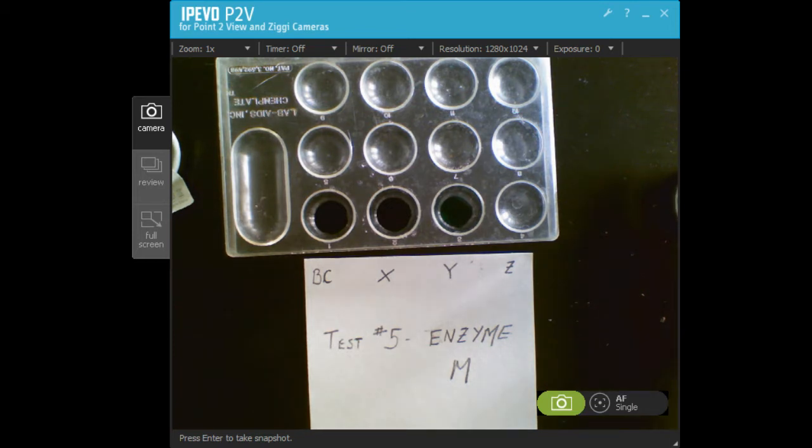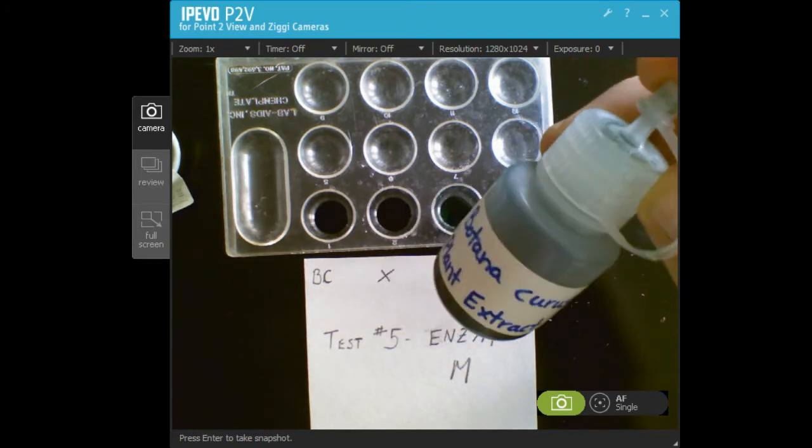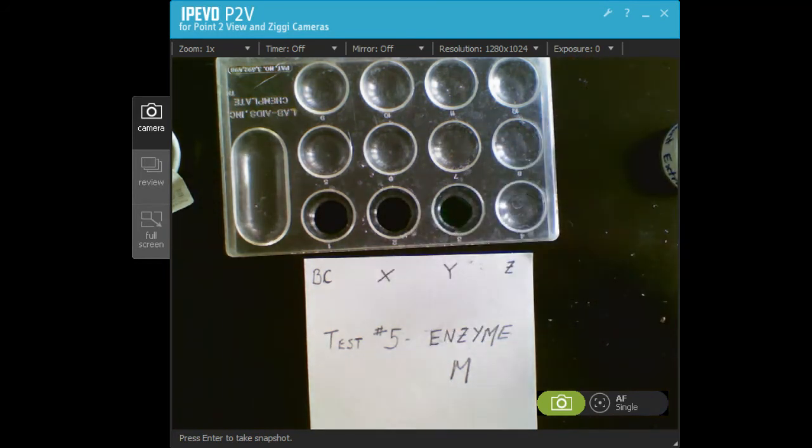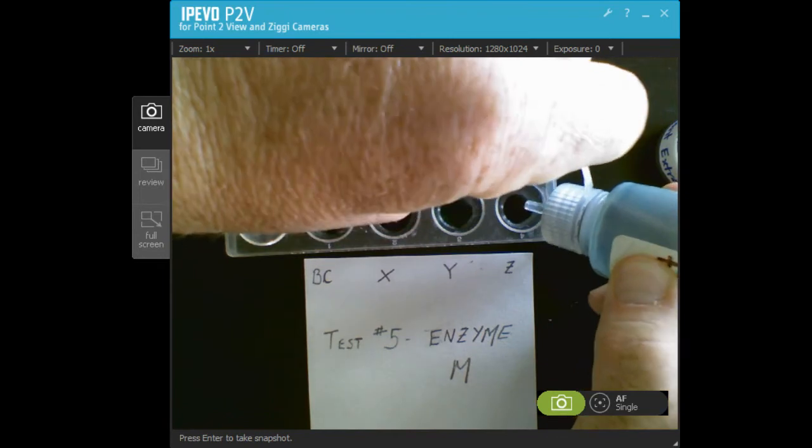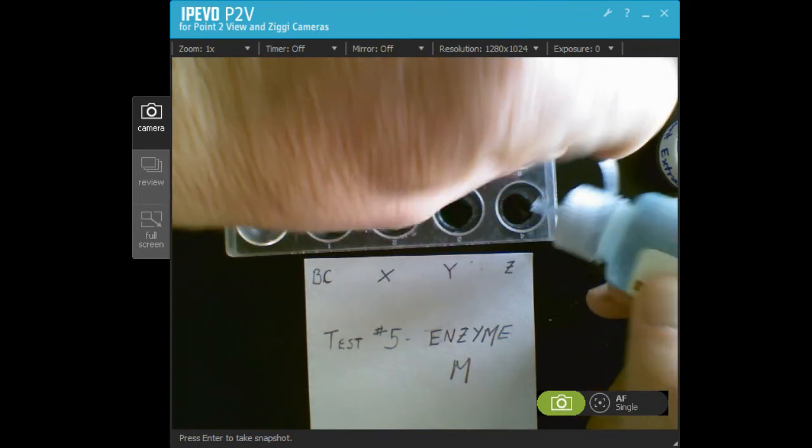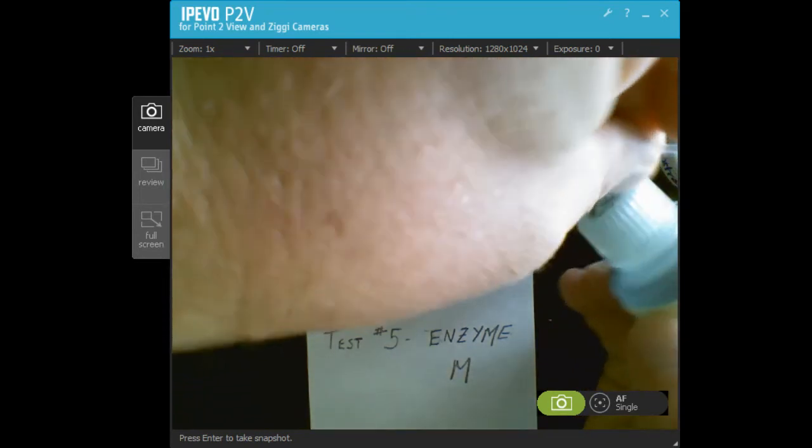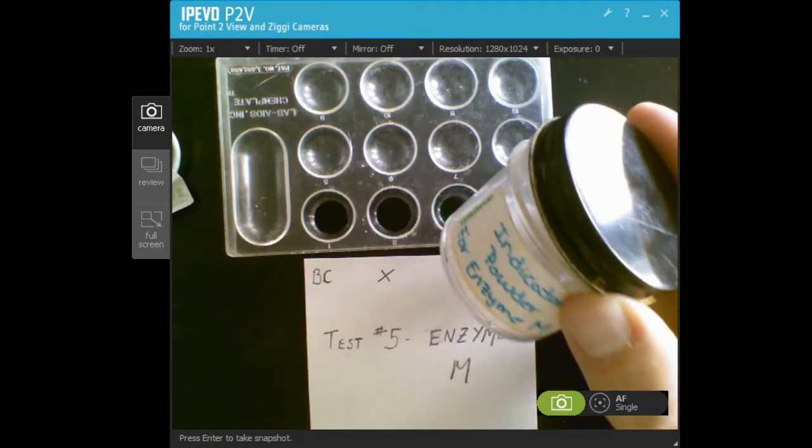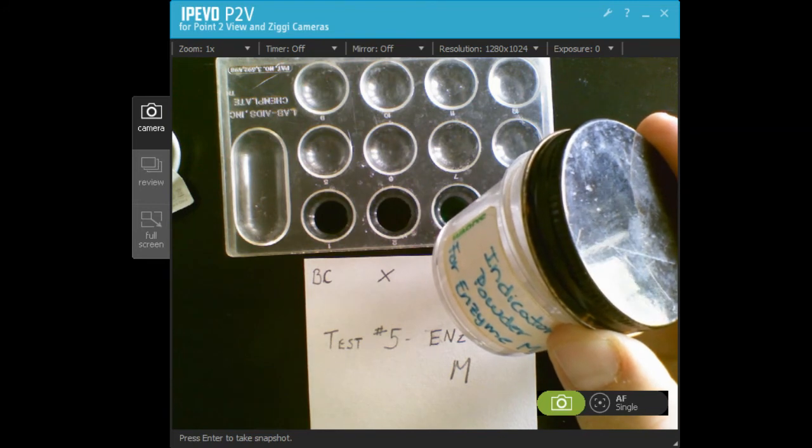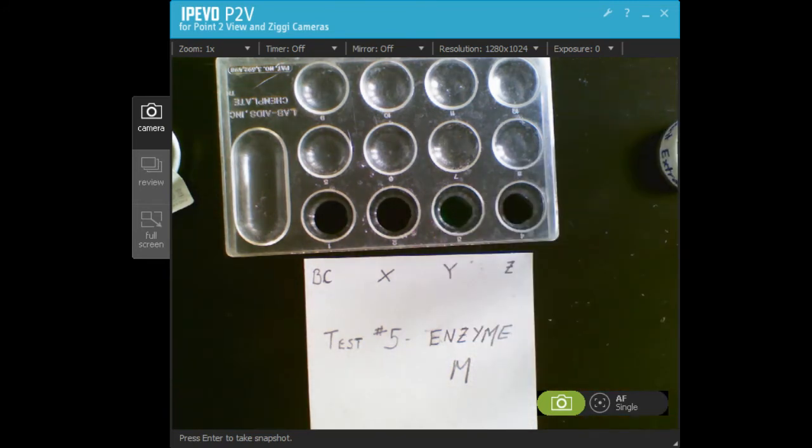You can see in the well plate here I have plant extract from Botanicuris, species X, Y, and I'm about to place plant extract from species Z. I am going to test for the presence of enzyme M with this indicator powder you see I have here.